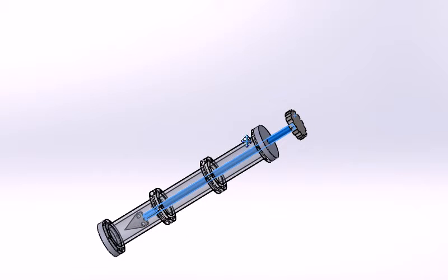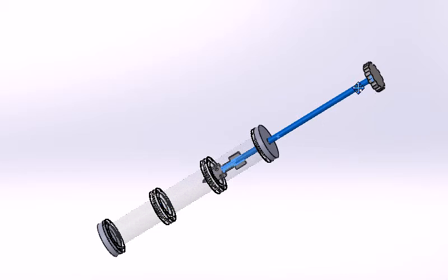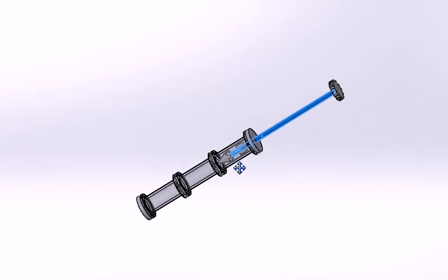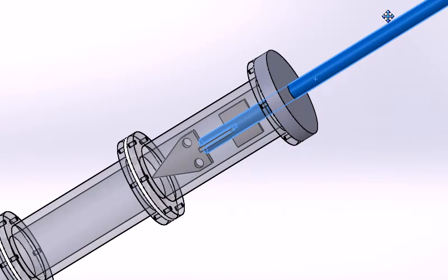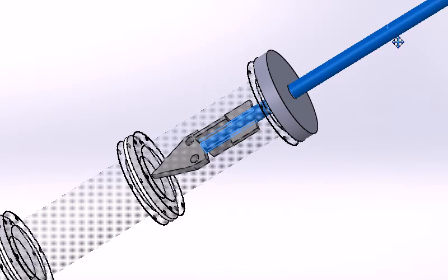A stainless steel shaft, and I'll move up a little bit here so you can see that the penetrator and mixer is really just a couple of paddles attached to that shaft.